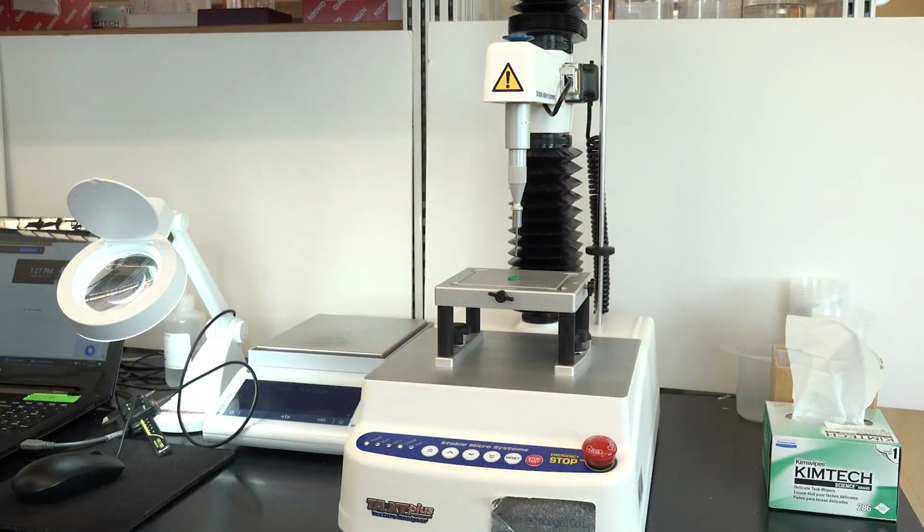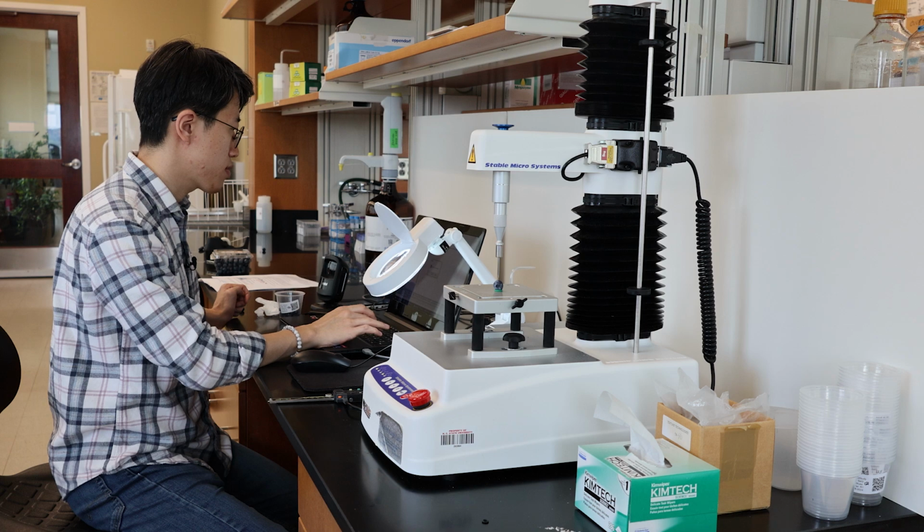A texture analyzer is one of the instruments that allow you to measure multiple texture components in a very accurate way. There are various instruments available for measuring fruit texture, but not all of them can measure more than one mechanical parameter at a time. A texture analyzer like this one is one of the instruments that are capable of assessing multiple parameters.